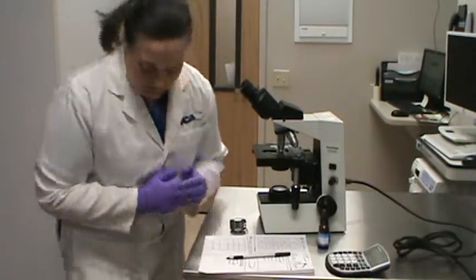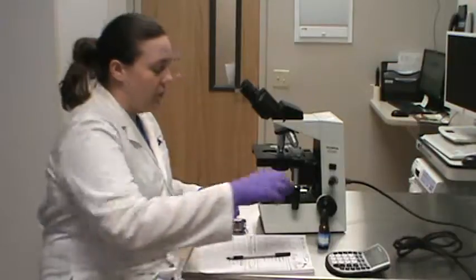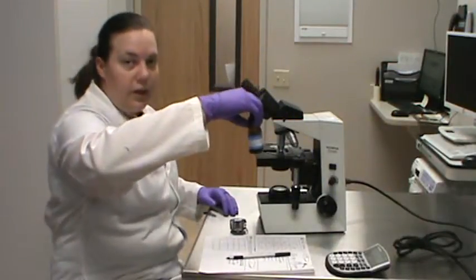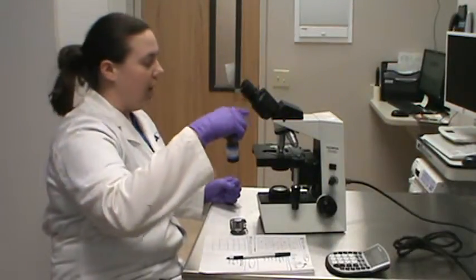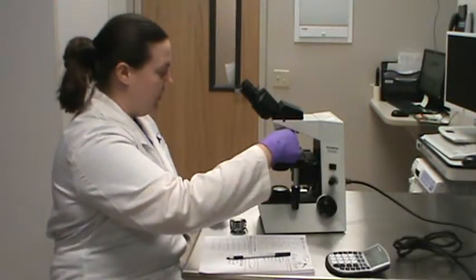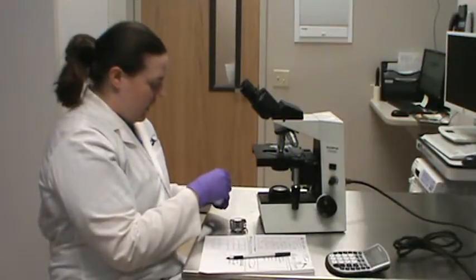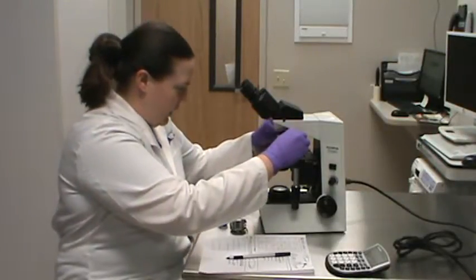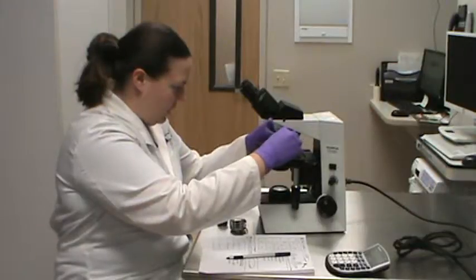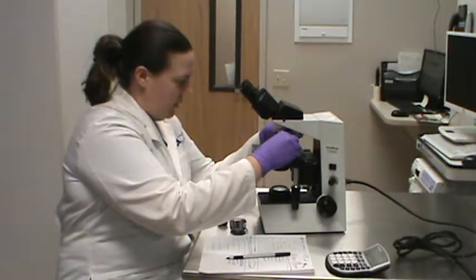First things first, we're going to take our immersion oil and apply 1 drop onto our slide and then switch it over to our 100 times lens, which is our oil immersion objective lens. So I'm just going to go in between the 40 times lens and the 100 times lens and keep it there for a sec.